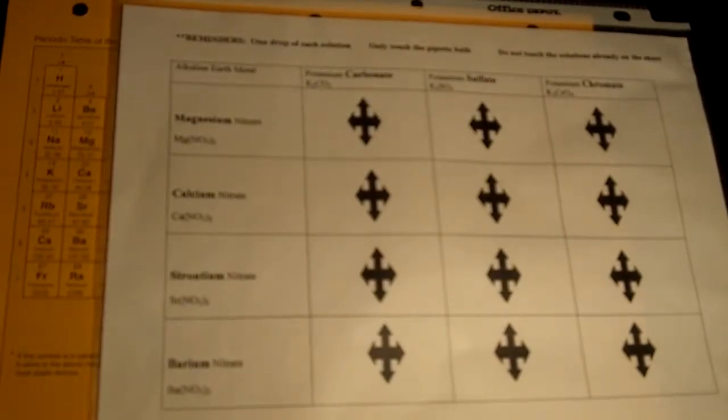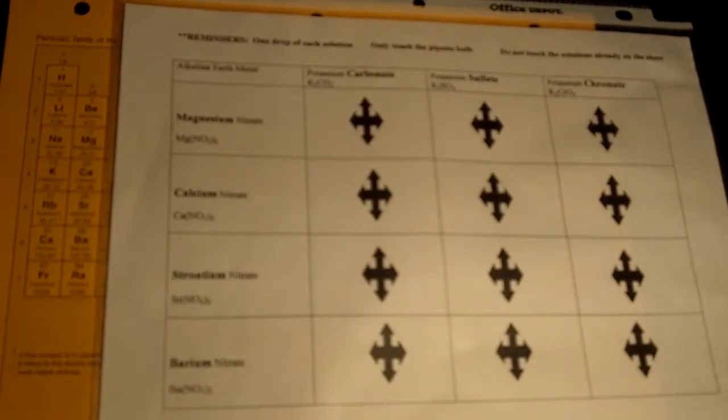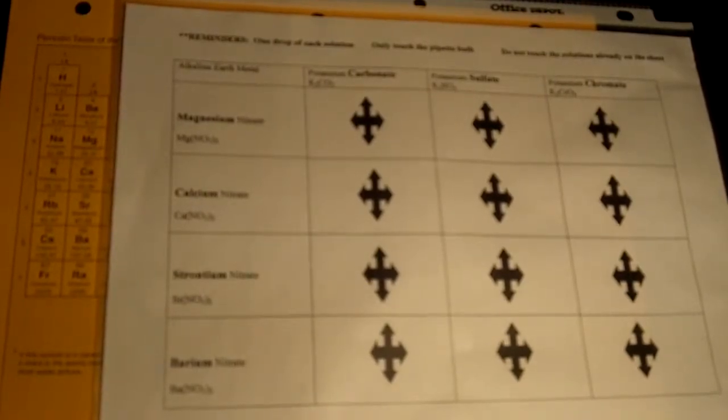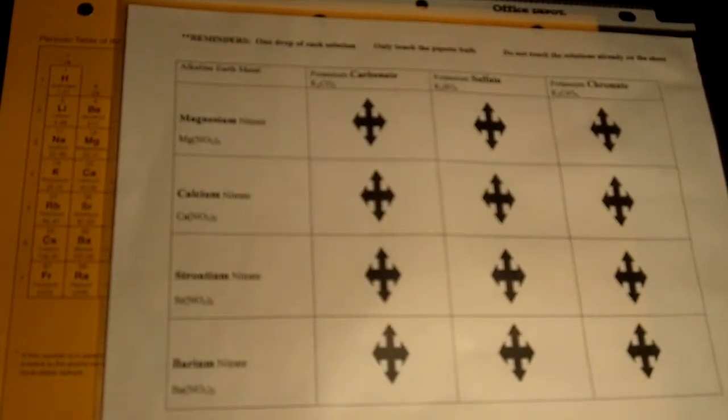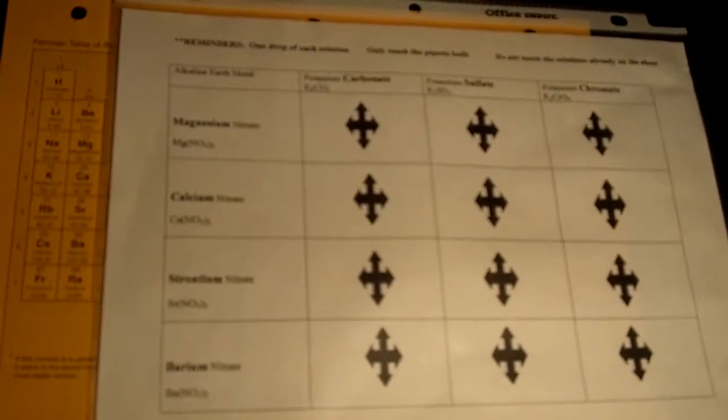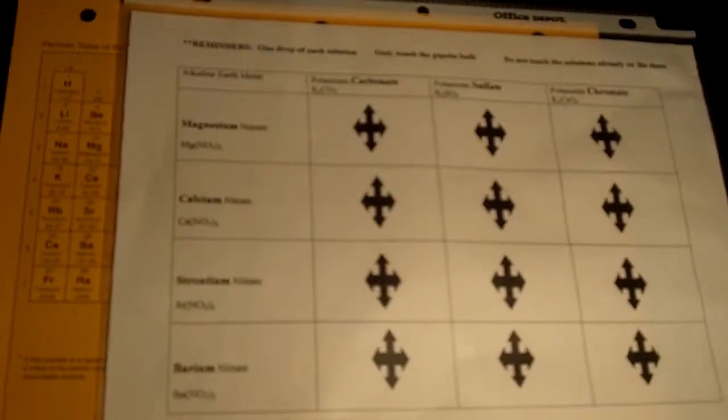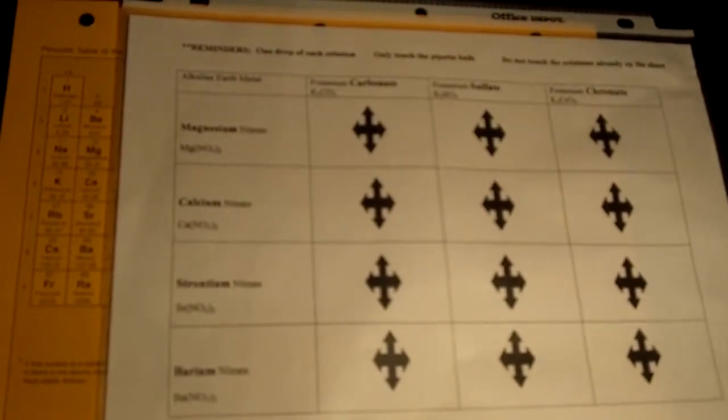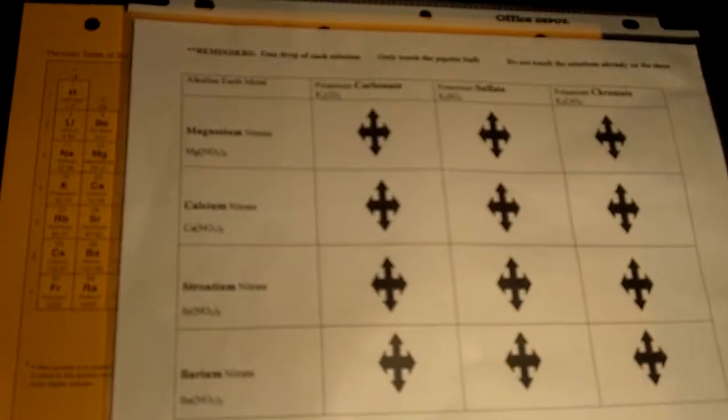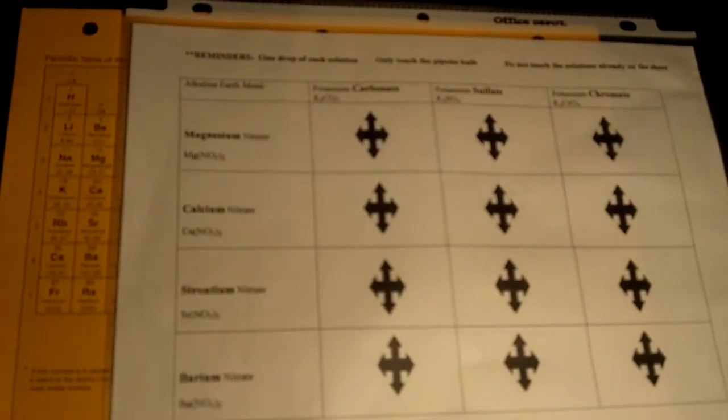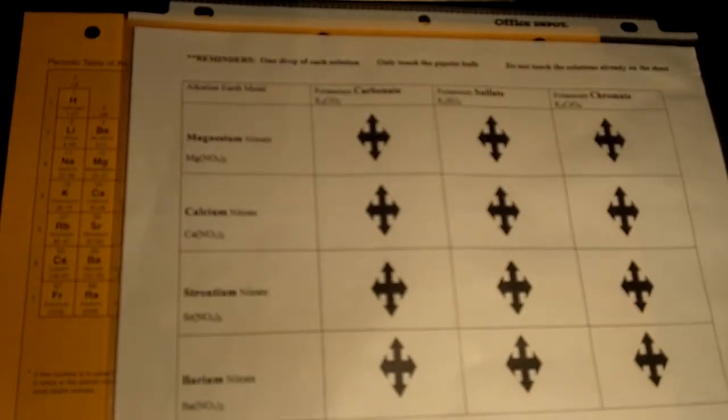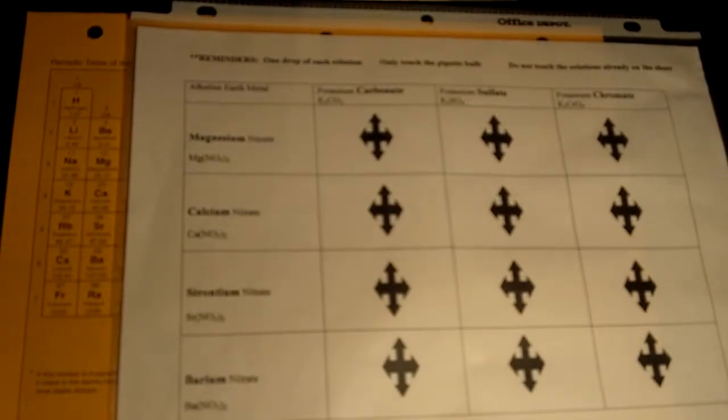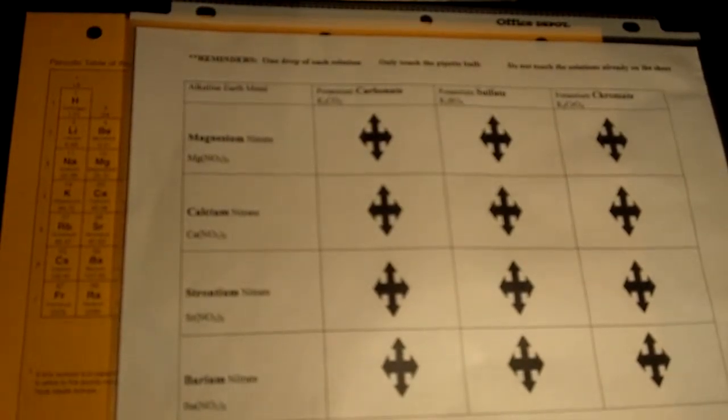The procedure. Alright, so for the procedure here, I'm going to keep this as simple as possible. The first thing we're going to do is load up the reaction surface, which is basically just a sheet protector. We're going to load up the reaction surface with the potassium compounds. When you do that, you want to put just simply one drop on the reaction surface. It's very important, though, that when you do this, that you do not touch the pipette to the reaction surface, and that you do that in order to avoid contaminating it.